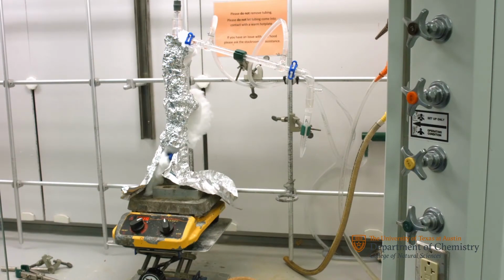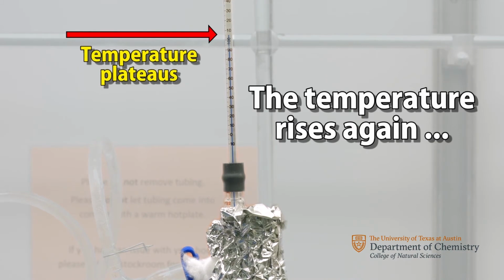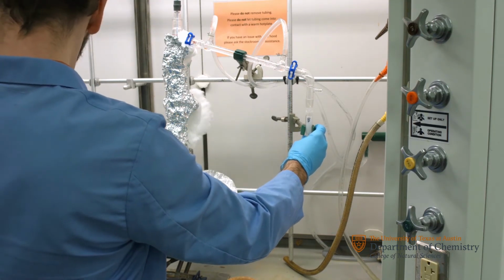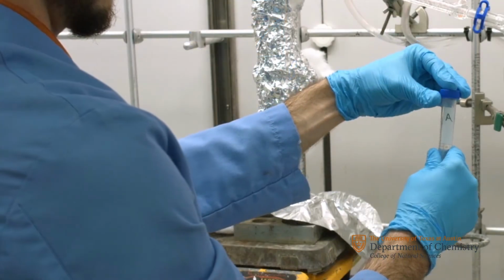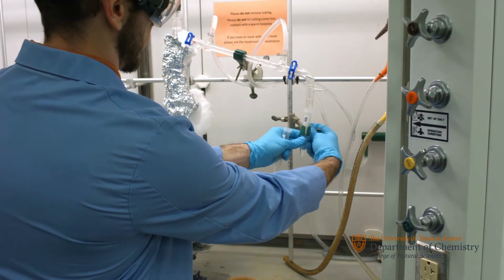Collect distillate in centrifuge tube A until the temperature starts to rise a second time. Switch tube A with tube B. Try to avoid losing too much distillate. Place the cap onto tube A. Continue collecting distillate in tube B until the temperature starts to plateau a second time. Now switch to tube C and place the cap onto tube B.